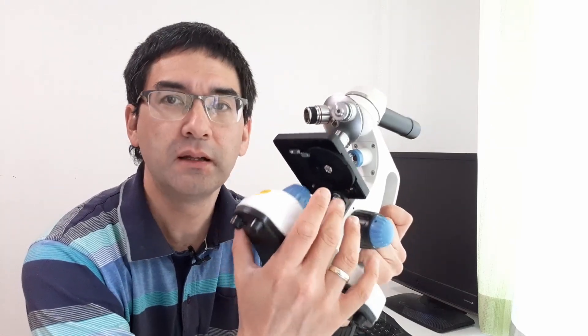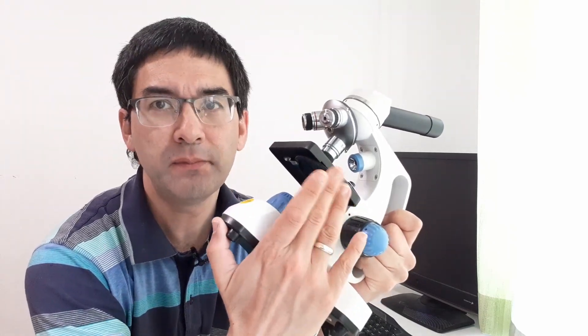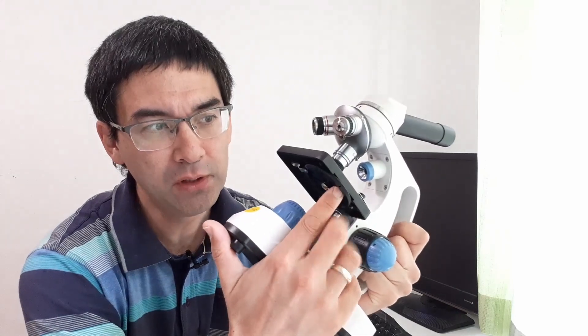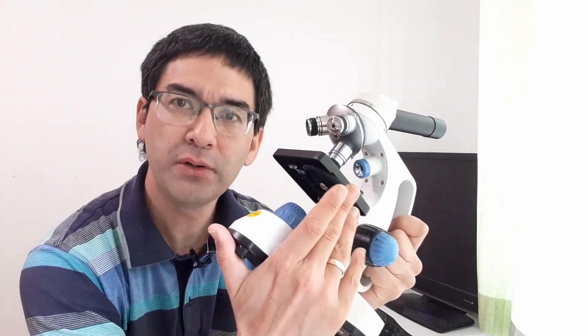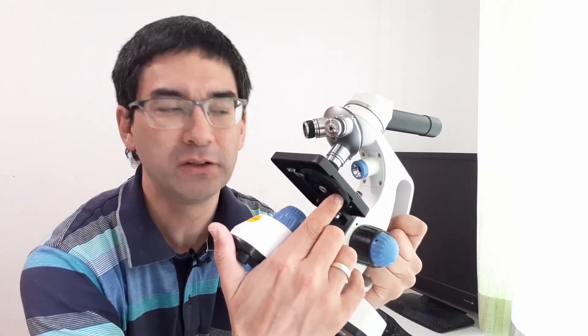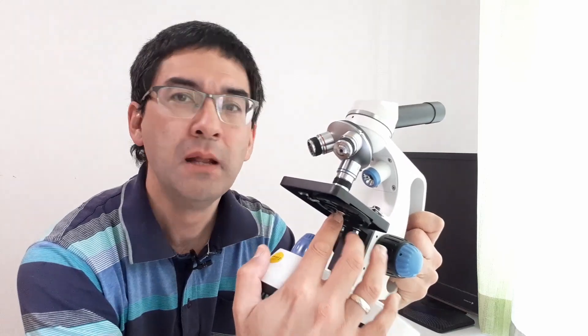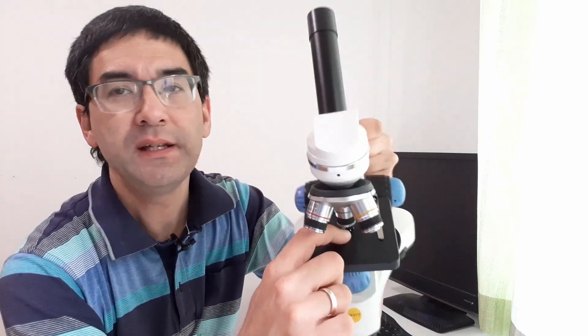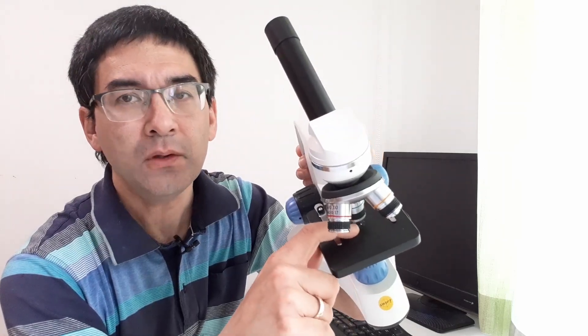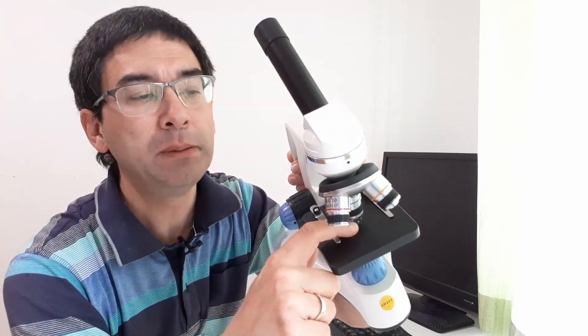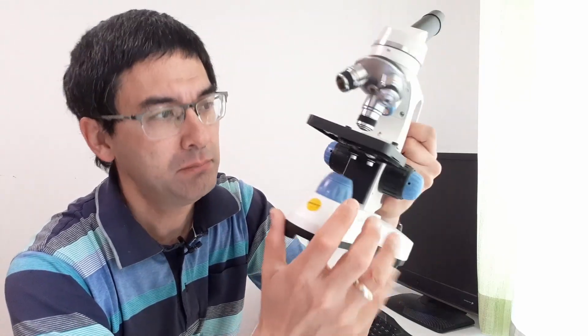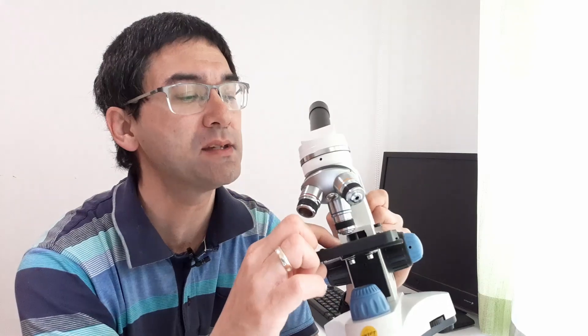And the second thing is it does not have a condenser. Normally microscopes that are a little more expensive have an optical system beneath the stage which bundles the light. Here all you have is a plastic rotating disc with aperture holes. In a different video I'm going to show you how you can upgrade the microscope yourself by adding polarization filters here. In the stage there is also a lens which actually bundles the light a little bit but it's not a complete replacement for a condenser. It does appear to be glass and not plastic, and if this is really the case then this is actually also quite nice.